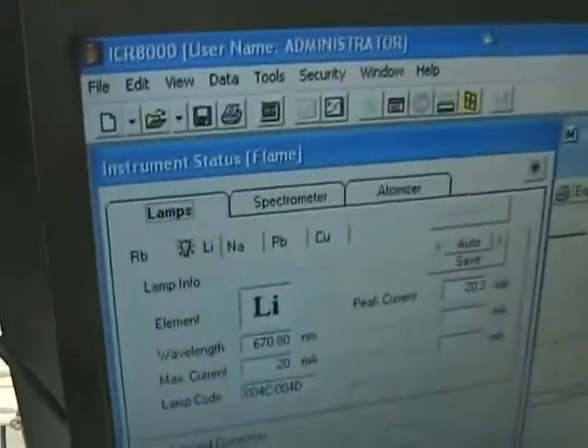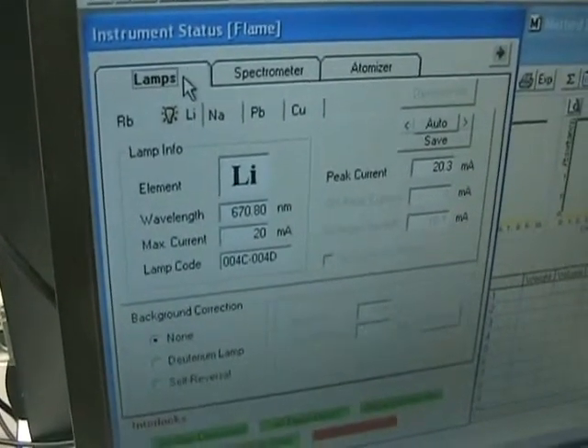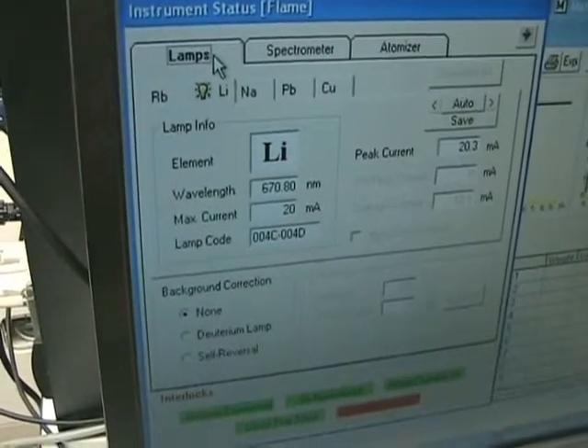The first tab here is the lamps tab. This gives you the option of picking which lamp you want to run depending on what metals or substances you want to test.